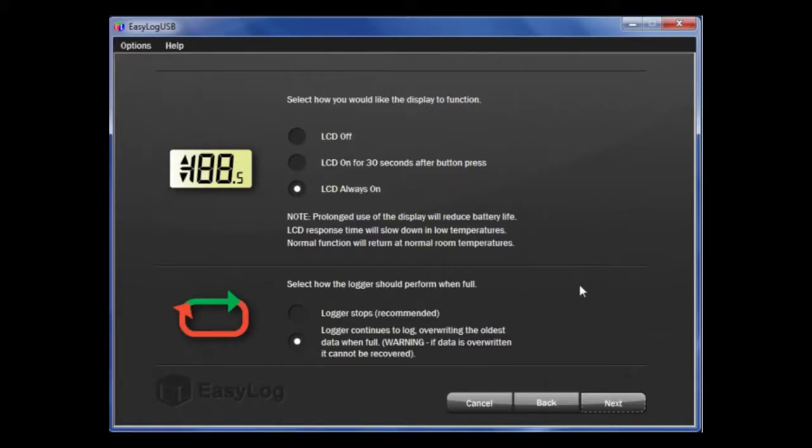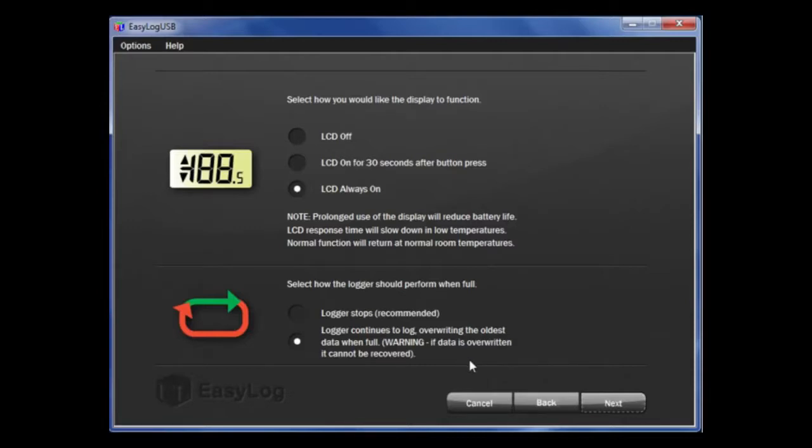Next, you can choose if you want the data logger to stop when it is full, or whether you want it to roll over and continue to take readings. If you are simply interested in alarms, then perhaps a rollover option is better fit for you. If you need to download and save all readings, then programming the logger to stop may be a better option.